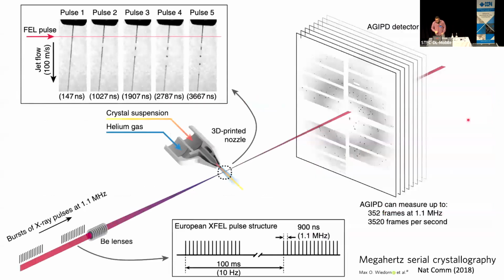However, if you want to do high rep rate crystallography, you can already at the European XFEL. This diagram shown here is a typical setup for doing high rep rate crystallography at the EU XFEL. I'll go through this loaded slide in steps.